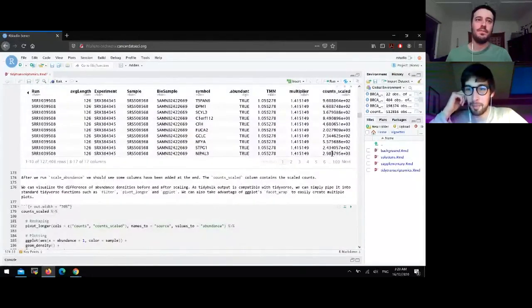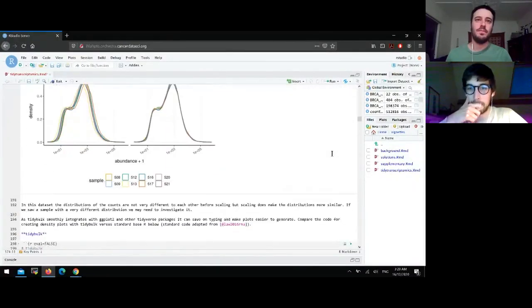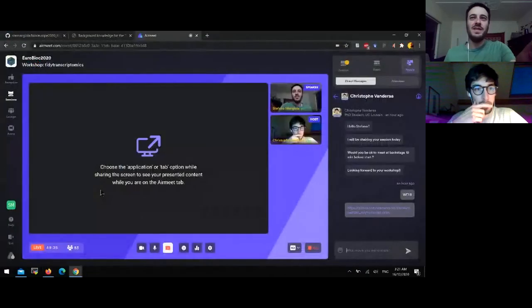What is actually happening behind the scenes? I'm not entirely sure I could follow it. Are you clear with the effect that this has?